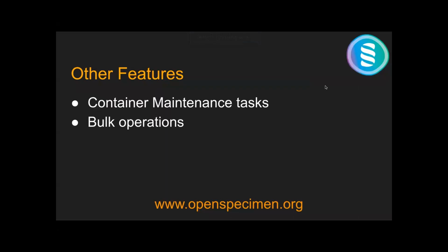So apart from that, we have some other additional features like container maintenance tasks. Many times people say my freezer needs a cleanup, my freezer needs to be defrosted. Sometimes a freezer is deliberately turned off and all the containers are moved to a different position.